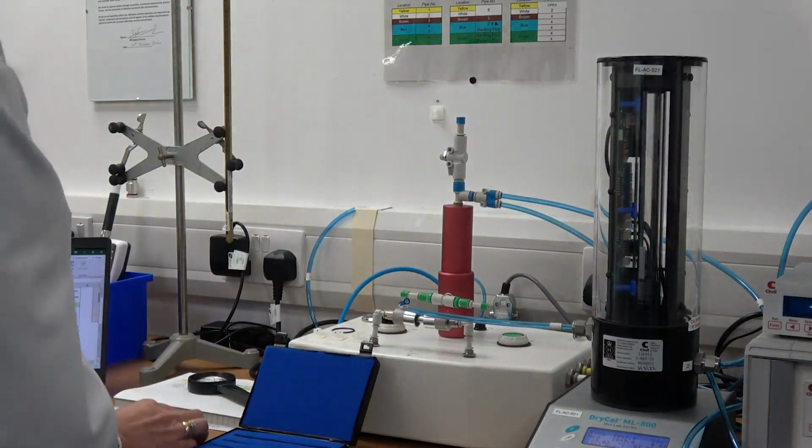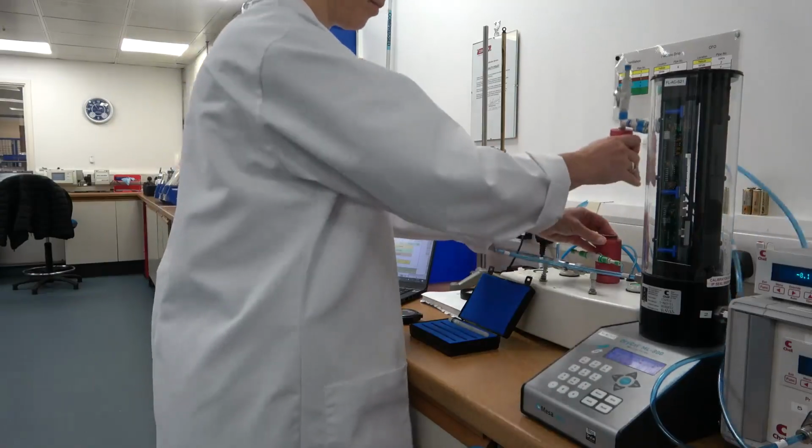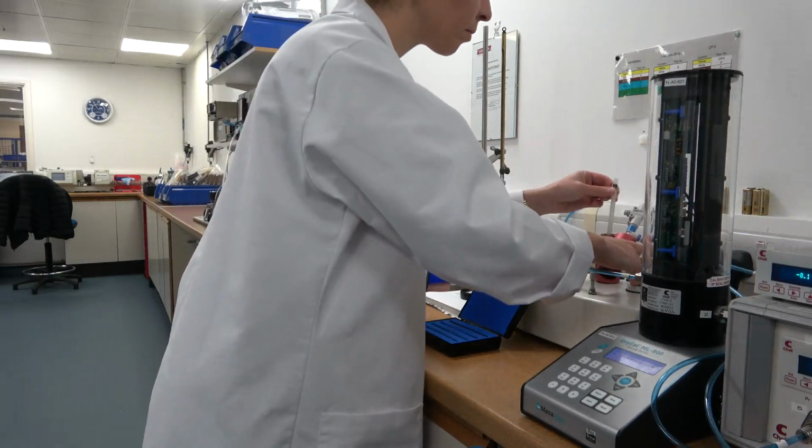In use, air is passed through the standards. Air from the surrounding atmosphere will almost certainly contain dust particles that will slowly contaminate the capillaries. Calibration standards should therefore be stored and handled with care to avoid damage or excessive contamination.